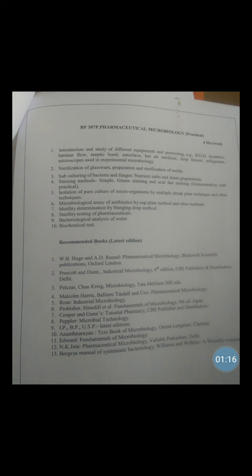The apparatus required for this practical includes a staining tray, glass slides, burner, and inoculating loop. The equipment required is a microscope.